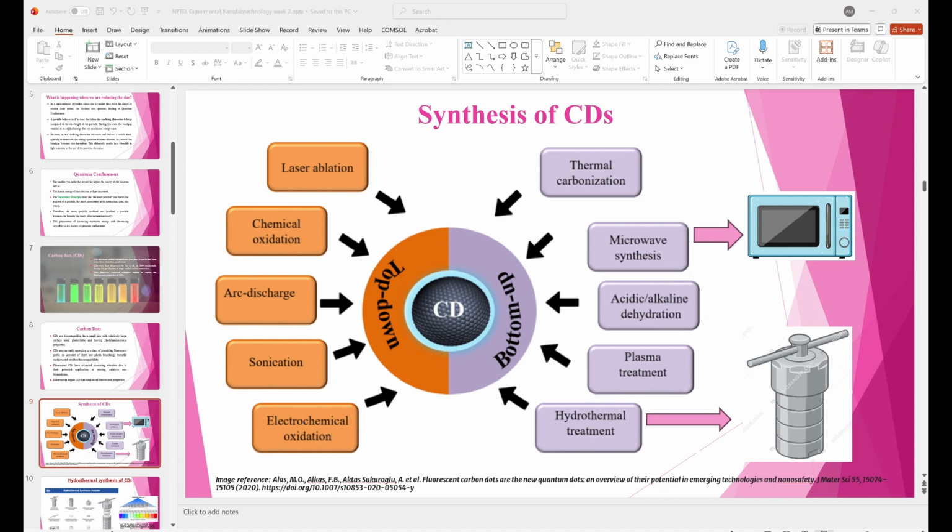You should always check whether your synthesis reactor can withstand the working temperature. If it can withstand a maximum of 200, then you should not keep the reactor at 200 degrees in the autoclave for 6 hours or 8 hours or 10 hours. Then also it expands and the reactor gets destroyed.